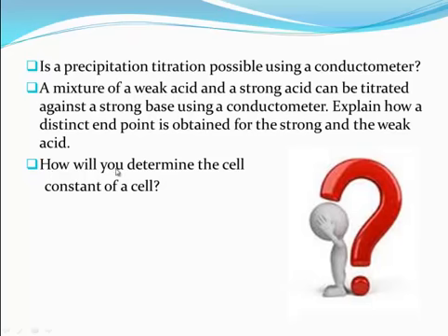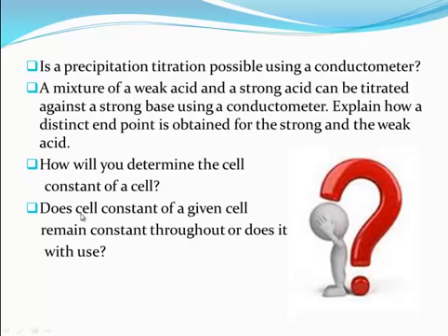Then the next question, how will you determine the cell constant of a cell? Now the last question, does cell constant of a given cell remain constant throughout, or does it change with use? So that means I'm asking, will it change with wear and tear or not?